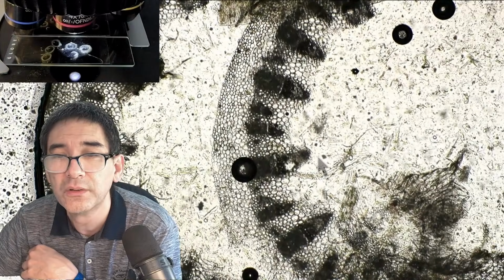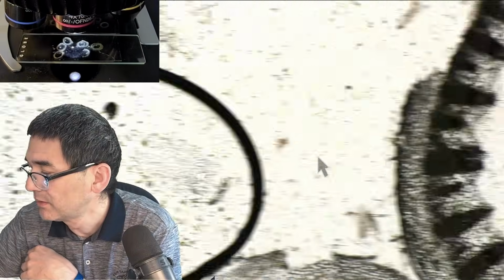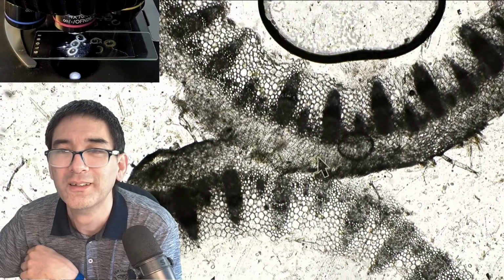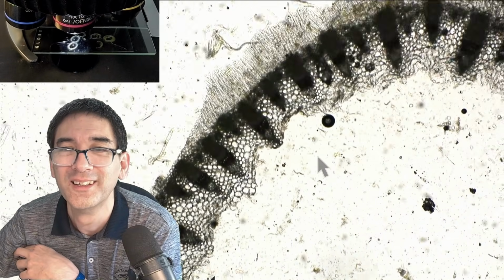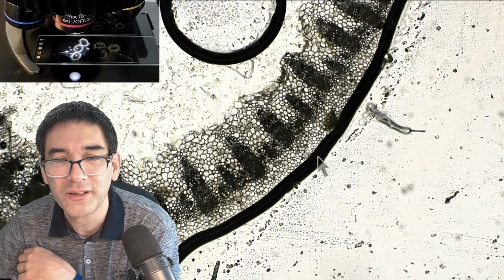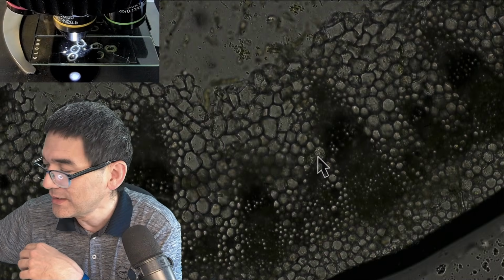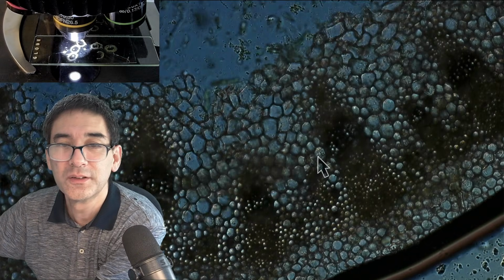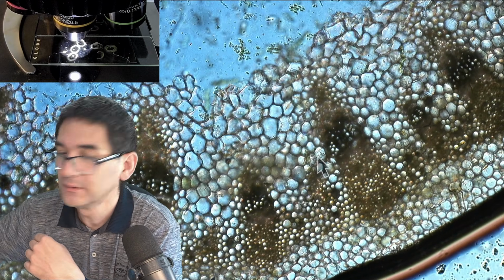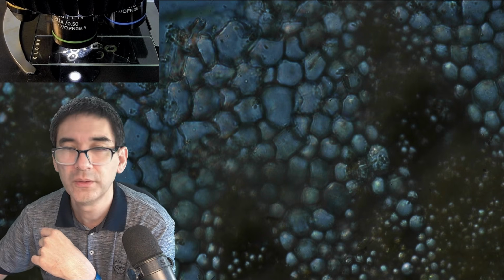What about this one over here? But honestly, it is not a huge improvement. Rather, it doesn't look quite as nice. Let's see here. Okay, well, doesn't matter. I'm just gonna go up with the magnification in any case. Let's turn on DIC as well. And this weird arrow, I want to get gone.